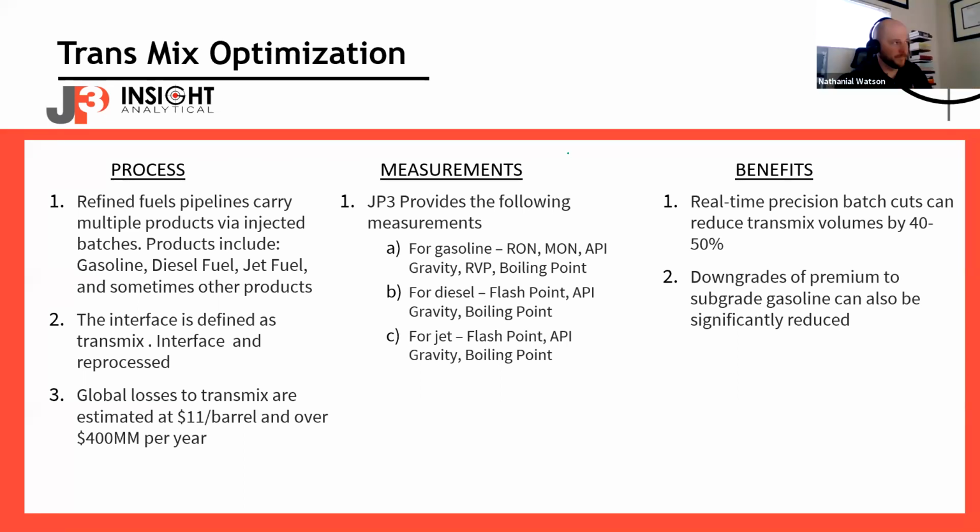Yes. Hi, I'm Nate Watson. I run Chemometrics for JP3, so all the team that does the model building works for me. The answer is it varies a lot, because there's a lot of literature on this. One set of rules of thumb most people could get at is ASTM 6122, which lists, if you're going to say that your model is in accordance with ASTM 6122, a lot of requirements you have to meet. Basically, the more complex your model, the more samples you need. But like Phil said, we now have about 30,000 calibration samples sitting in our library.